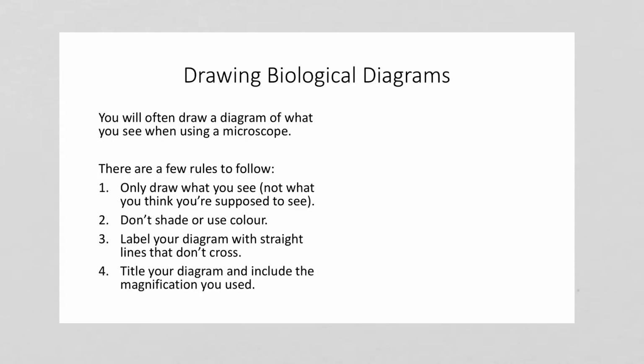When you're using a microscope in lesson, you will often be asked to draw a diagram of what you see, and there have indeed been questions on an exam where they give you a picture from down a microscope and ask you to draw and label, so to do a biological diagram. A couple of really simple rules to follow here when you're doing your diagrams, but also if you get it on an exam.